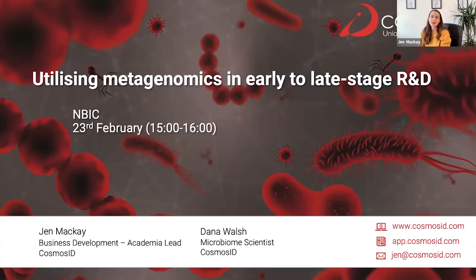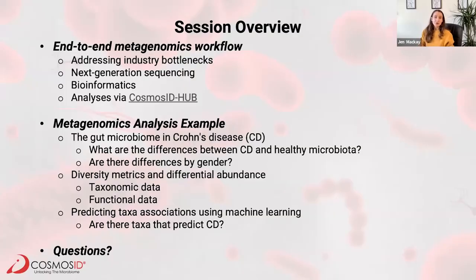So the talk today is really almost an intro to metagenomics, as Mark said, for PhDs and postdocs in the NBIC community. Lovely to meet you all. I'm Jen. I work as the academia lead within the business development team here at CosmosID. What I'm going to do is walk you through a standard metagenomic workflow to set the context and to introduce CosmosID. For anyone new to this, it should set the foundations for what a metagenomic study entails. I'm then going to pass over to Dana, our microbiome scientist, who has much more expertise than I do and is going to go into more granular detail through examples of analyses, and we'll leave plenty of time at the end for any questions.